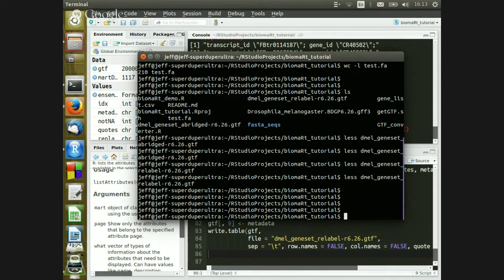Whenever I'm doing these, I sort of imagine someone judging me on the other end, like, what is this? A typo? Oh, rejected. But actually this package doesn't have that many functions. You're usually using the same functions over and over. We have actually covered almost every single one here, which is, I guess, sort of rare for these kinds of tutorials.